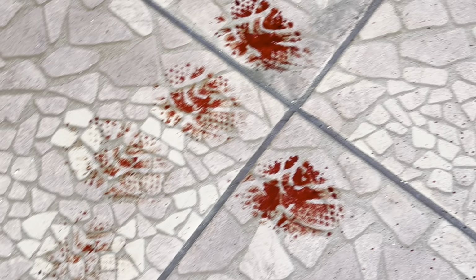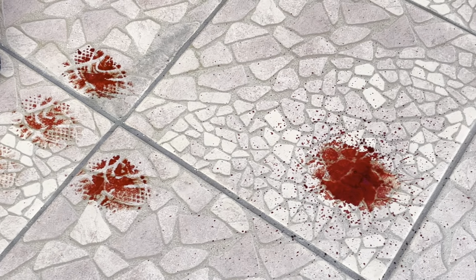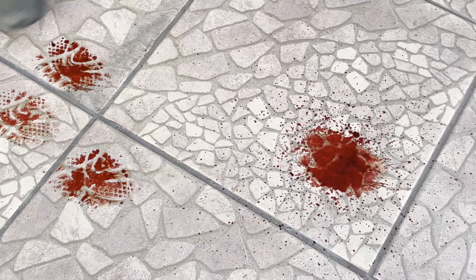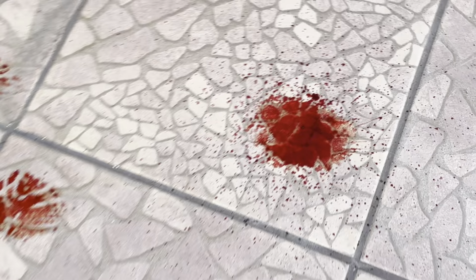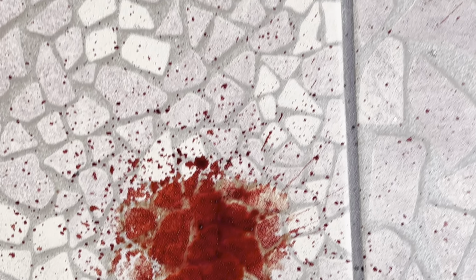Okay, so if you have somebody leaving a bloody crime scene, this is what you're going to see. You're going to see more blood at the beginning where they stepped in the blood pool, and then less and less blood as they're leaving the scene. And when you get way out there, you might have to use some enhancing reagents to actually visualize those blood stains. It's a little hot out today, so the blood is already starting to dry up.